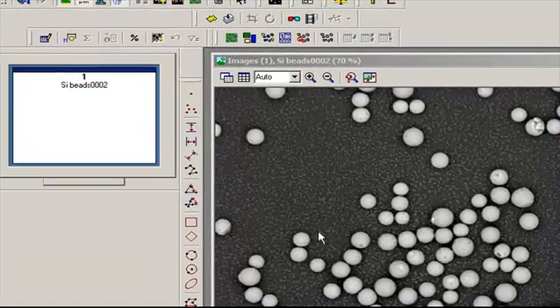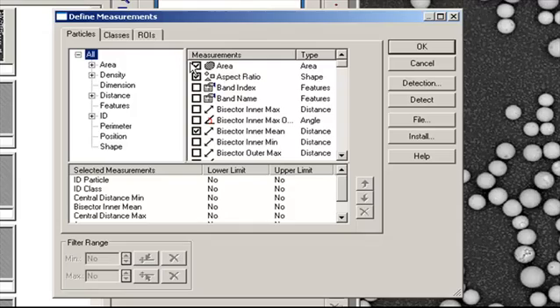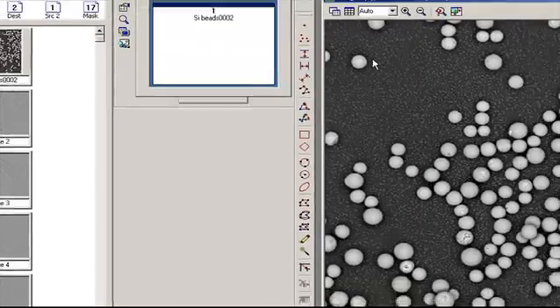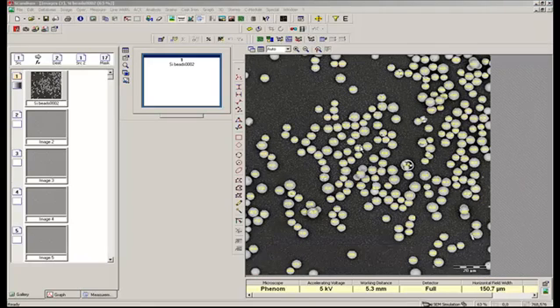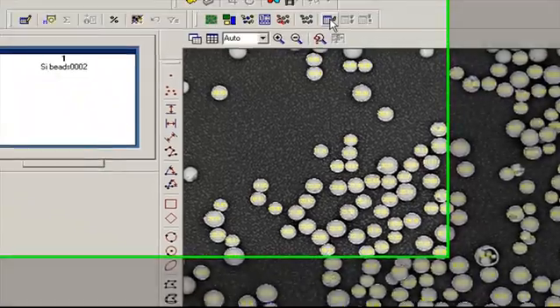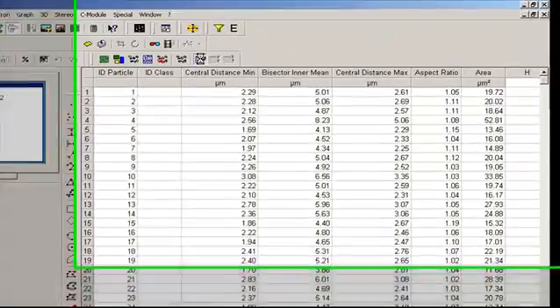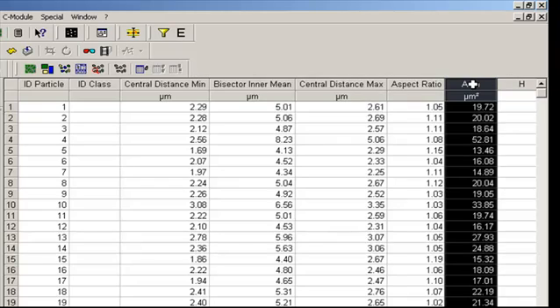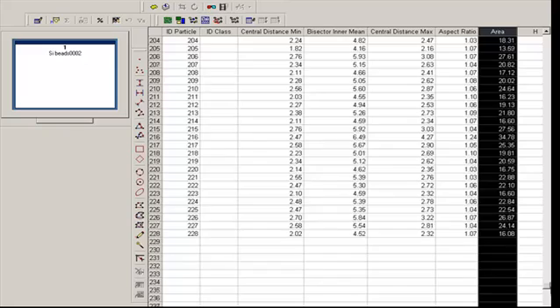The next step is to return to the Analysis toolbar, click on the Define Measurements icon, and that will bring up a list of measurements to include in the detection. For this application, make sure Area is included. Click OK, return to the Analysis toolbar, and click Detect. Now that the software has performed an analysis, go to the Analysis toolbar, click on the Particle Results icon, and a table with all the results will be displayed. In the far right, there is a column for area measurement, and scrolling down we can see a total of 228 particles measured on this image.